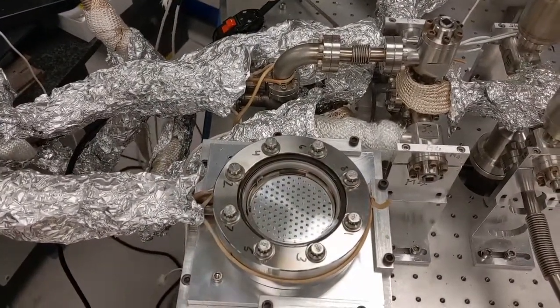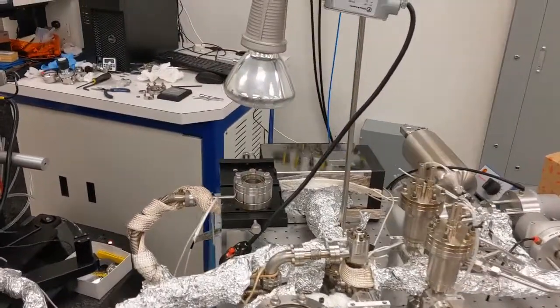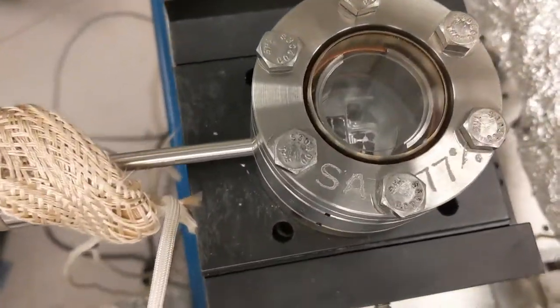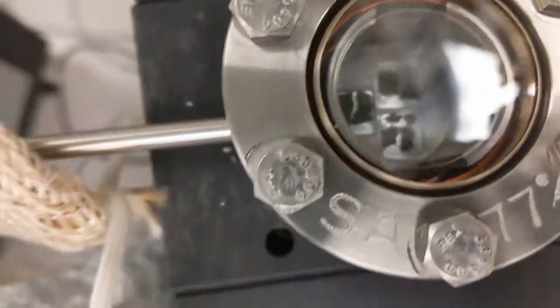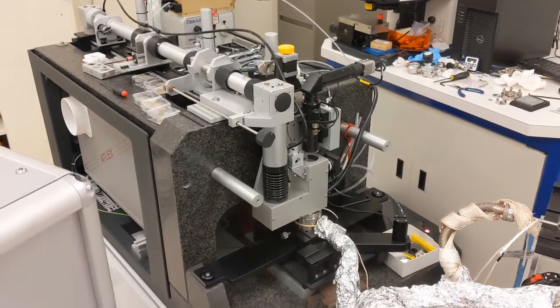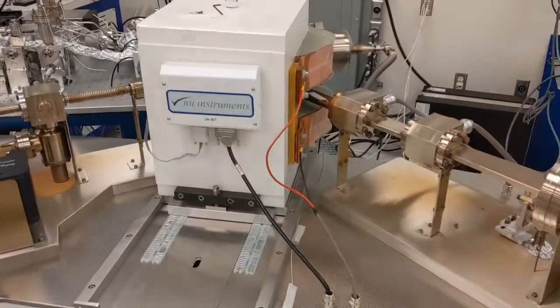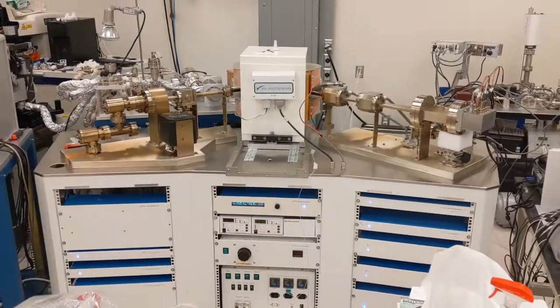The argon geochronology undertaken in our lab can be broken into two primary categories: laser stepped heating, where argon is released as a mineral is progressively heated to hotter temperatures, and ultraviolet laser ablation microprobe analyses, which utilizes a 193 nanometer wavelength laser to ablate small volumes of sample in a polished thick section. This method is particularly useful for achieving high spatial resolution chronology in petrographically complicated samples. For example, in my own work, this method is utilized to study lunar breccias returned by the Apollo missions to understand the history of samples that have been bombarded by impactors for billions of years.